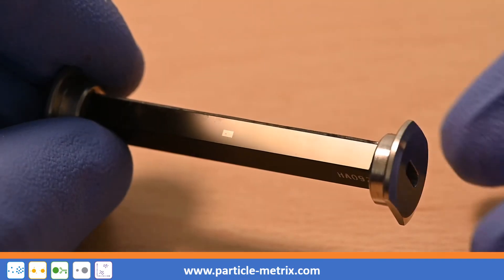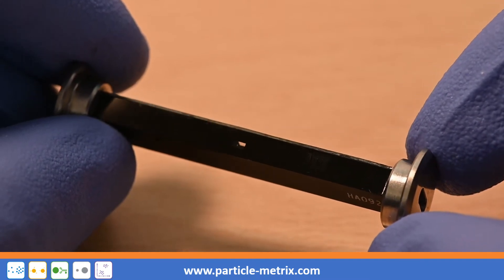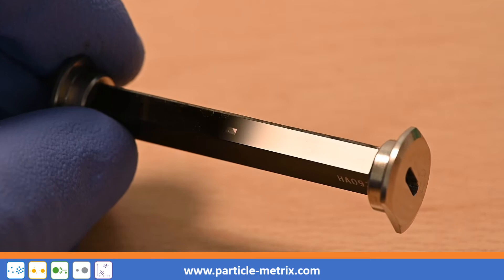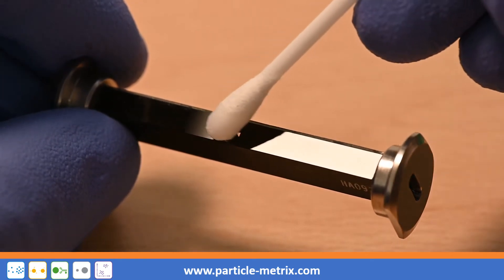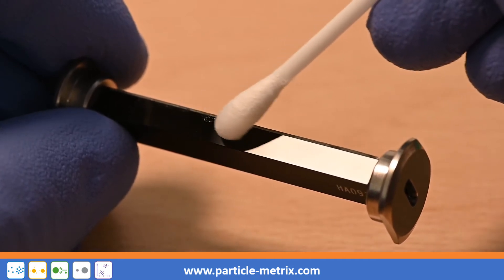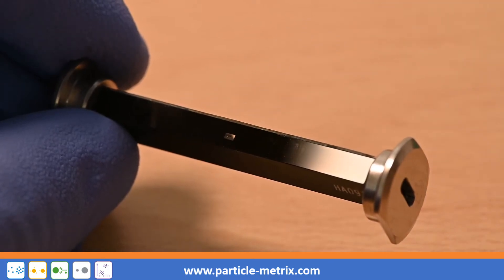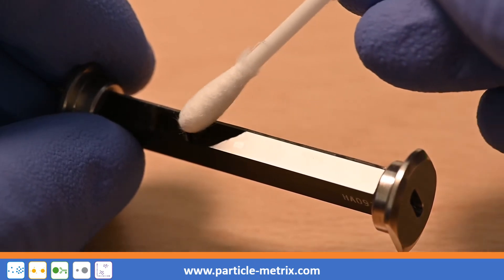Inspect the cell's optical window. If necessary, clean it with a cotton swab containing 50% acetone or 70% ethanol. Then dry wet areas of the cell with a dry cotton swab.